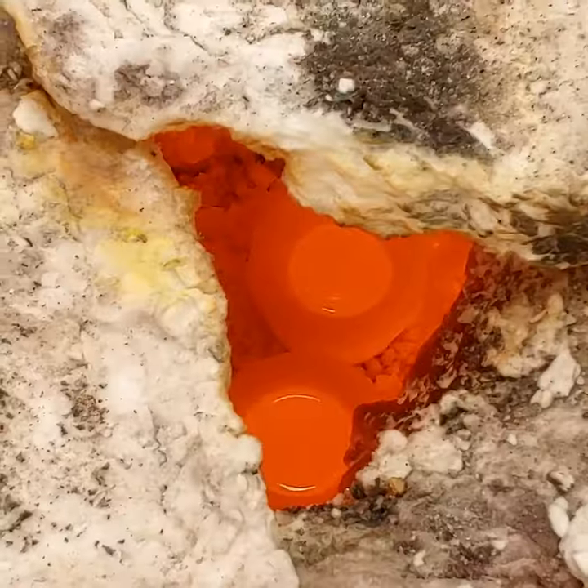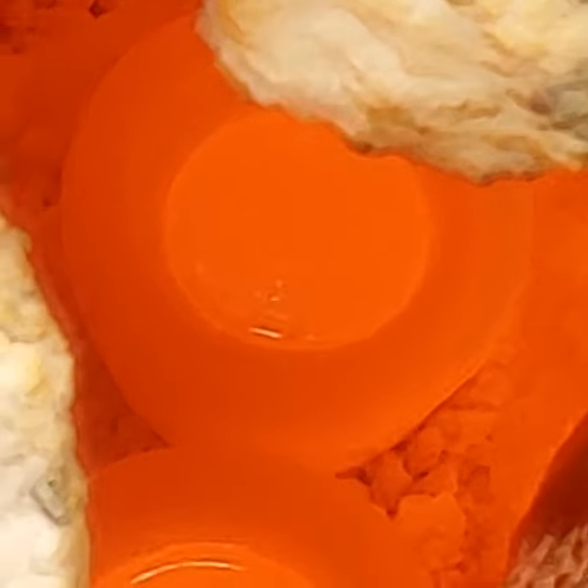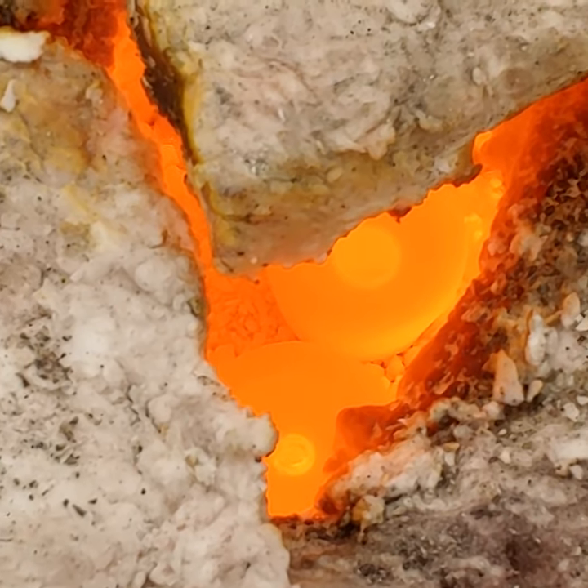We've got the lead going cupelling in my propane furnace. I have a really strong oxygen-rich environment in there — not a whole lot of propane going in, and I've got the blower turned up all the way so that the lead oxidizes, gets absorbed into the cupel, and then we should be left with just our precious metals.